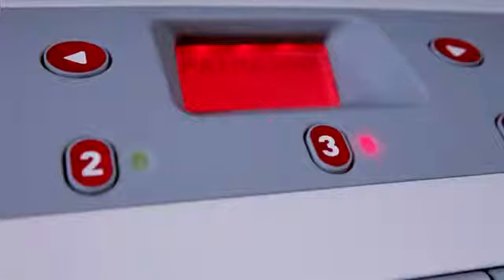The arrows let you scroll through system options and the lights indicate whether a run is in progress, finished or in standby.